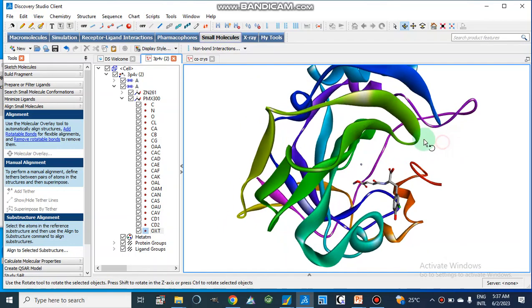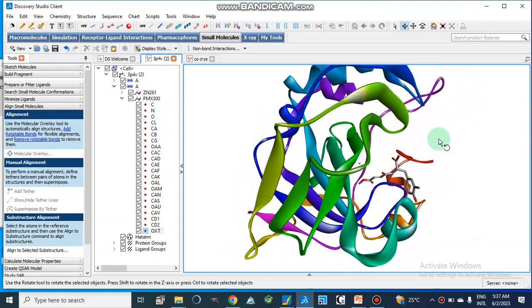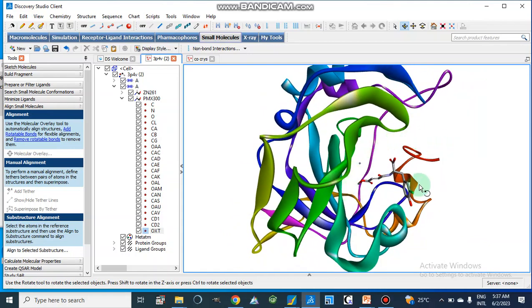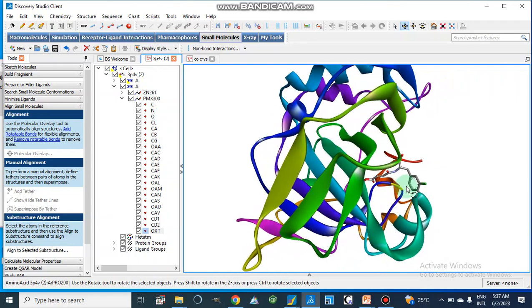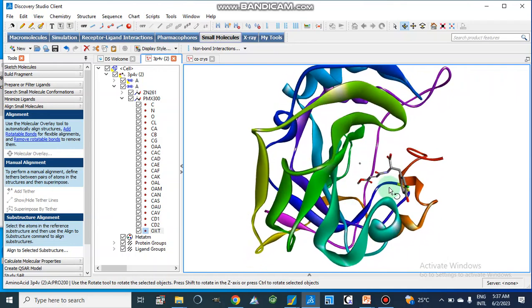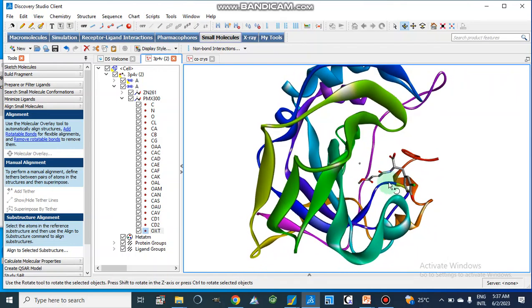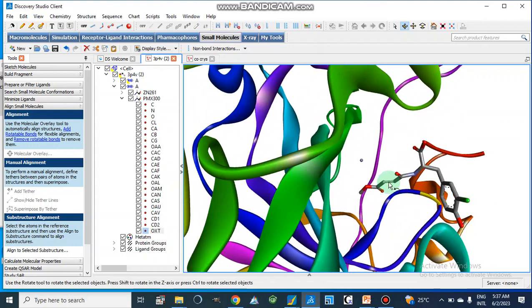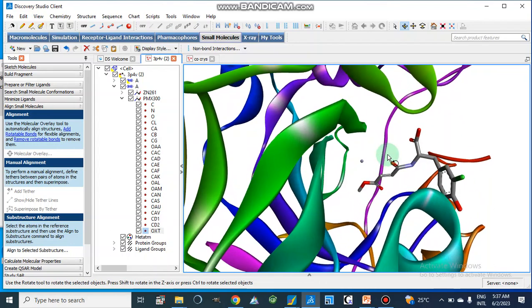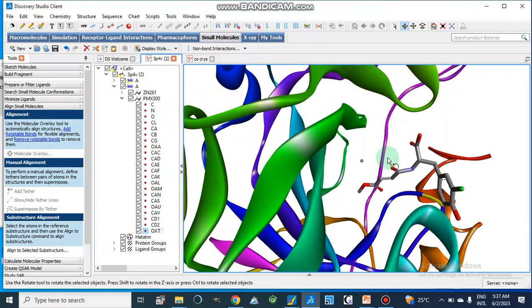Here I am going to show you in Discovery Studio Visualizer that this is our human carbonic anhydrase 2, which is 3P4V — the PDB ID code of this structure retrieved from the Protein Data Bank. We have a crystal structure where the inhibitor is co-crystallized inside the active site of this enzyme.